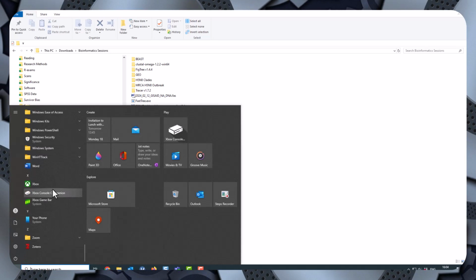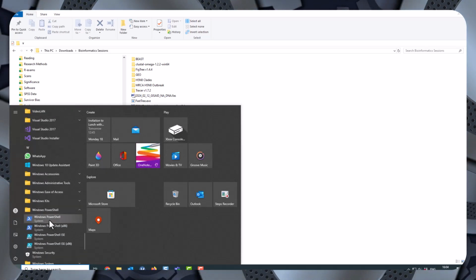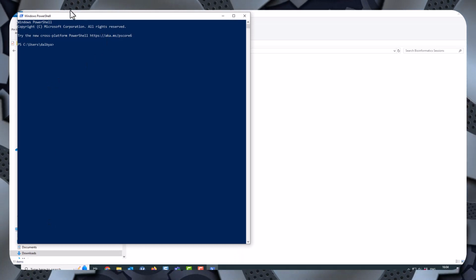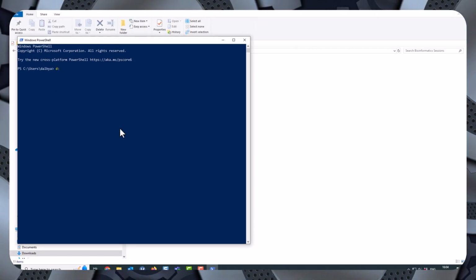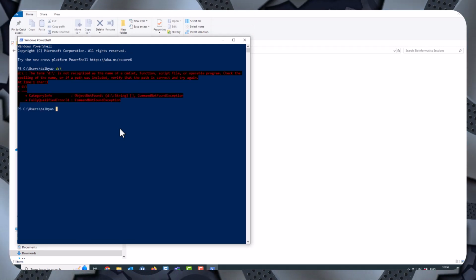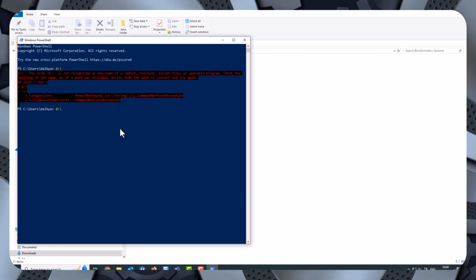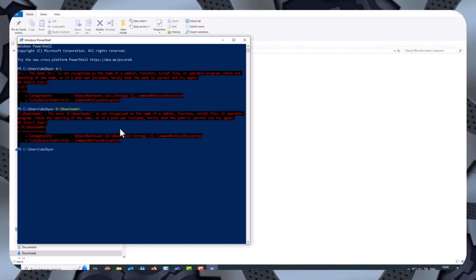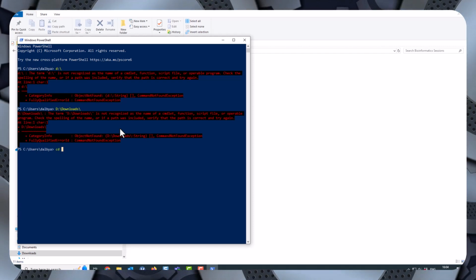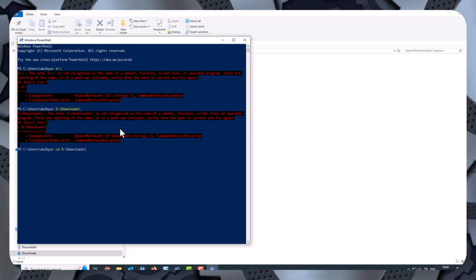The first thing I need to do is open Windows PowerShell. I'm going to use the x86 version. Oh, actually I didn't. I used the normal version. Doesn't really make any difference. Now I need to move to D, which is the directory which has my files. It helps if I don't just type D. I need to CD to D. And I've gone to D downloads. CD, that's better. CD D and downloads.